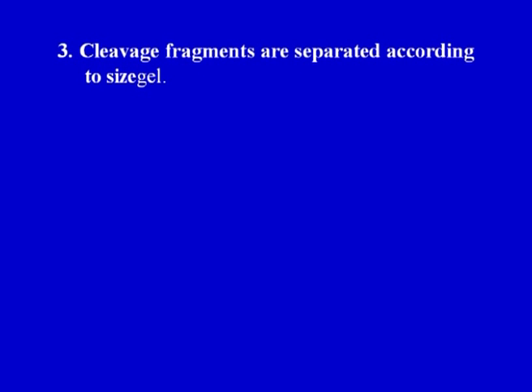Now, in all 4 reactions the conditions are adjusted so that the strands are cleaved at an average of 1 randomly located position each. Now, the cleavage fragments which are obtained will be separated on the basis of size. So, the 4 differently fragmented samples of DNA, that is A plus G, G, C and C plus T, will be simultaneously electrophoresed on a sequencing gel, as we have discussed earlier.